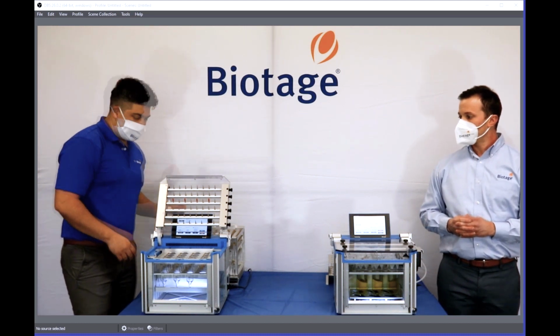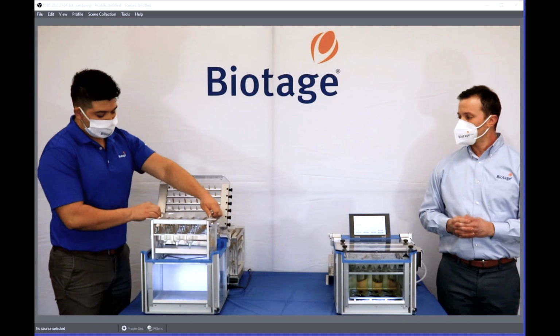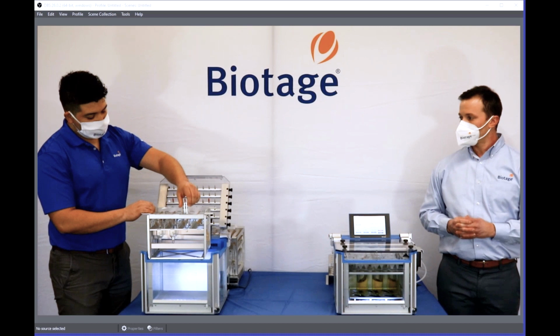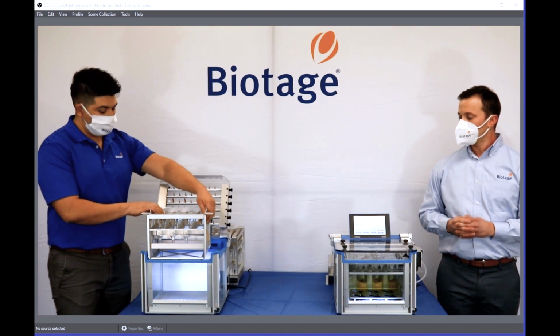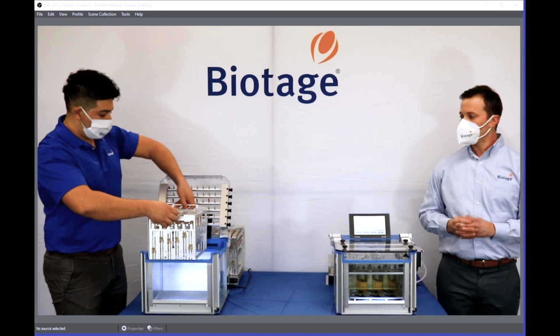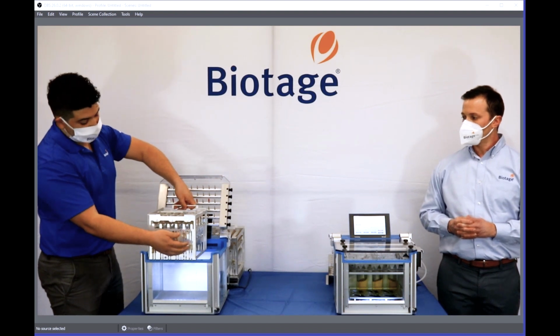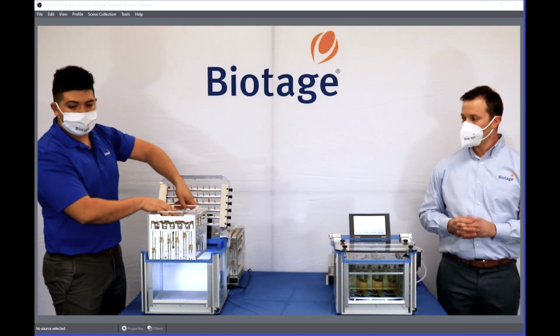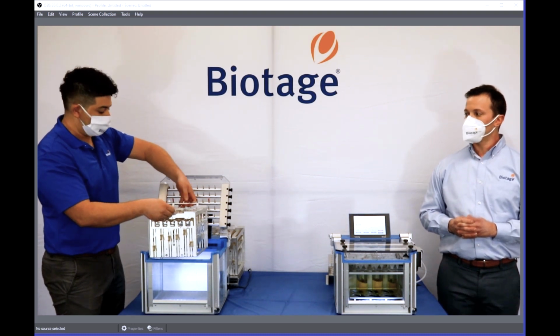And when we're ready, we have a rack that fits our 50 mil tubes. You simply slide it into the top, and it's a 24-position rack. And if you don't want to use these 50 mil tubes, that's fine. With this rail, it will slide up and down, and you can adjust to whatever tube is going to fit your rack and your procedure.